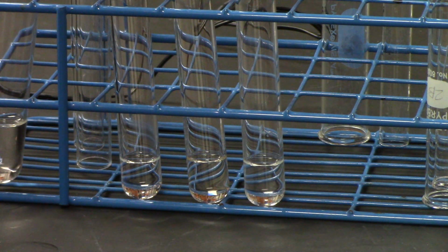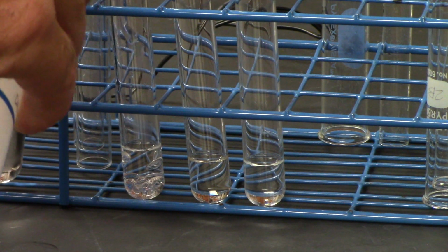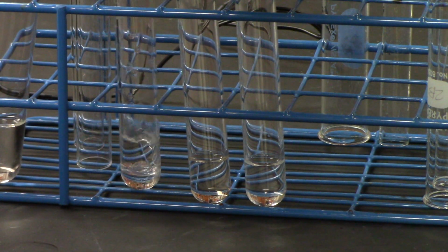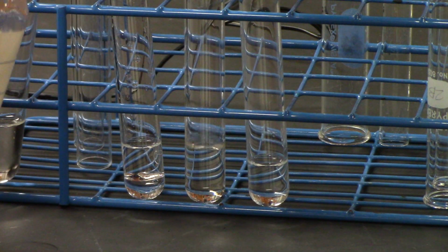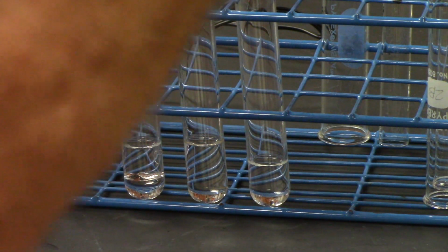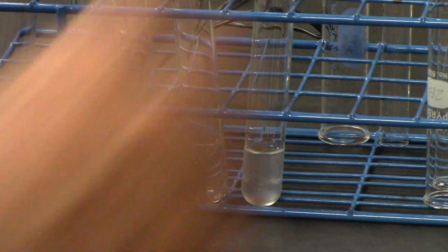And let's write the results. Okay, so put water in, first one. And again, it doesn't matter how much I add. All right, let's just put them all in together first, and then we'll look at them. Okay, second one, I'm going to put cyclohexane. We'll look at the results after I mix them all together here. And the third one, ethyl alcohol. All right. Okay, so let's look at each one.